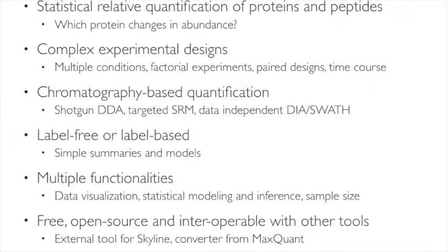Of course, it's very important to say that this is free and open source. It's entirely implemented in R. It is available by itself, and that's what we will practice today, working with this within R. But there are also other opportunities. For example, for Skyline, it is available as an external tool. So if someone is afraid of R and doesn't want to see it, you can just click and use the graphical user interface from Skyline. Now, the problem is that the options available through this are more limited. So it is really better if you can use the full-blown version within R, but this is an option as well.